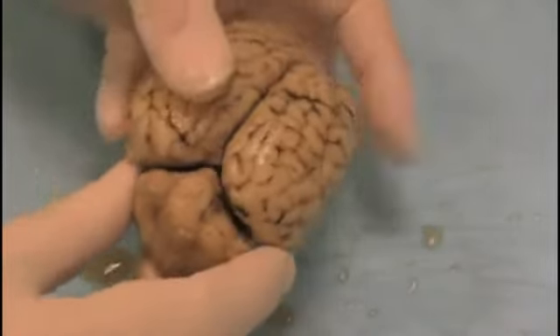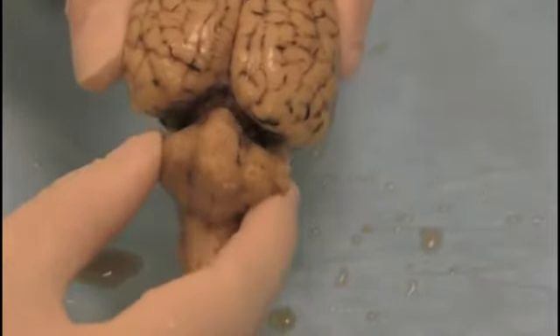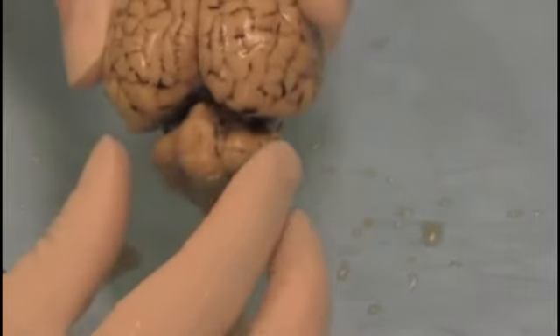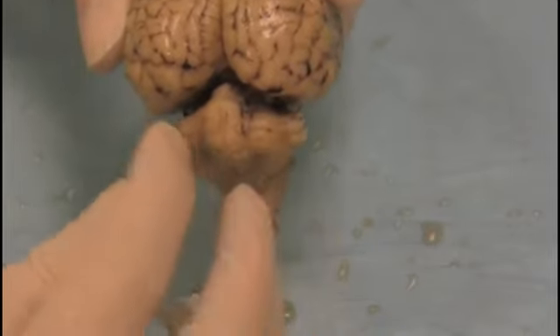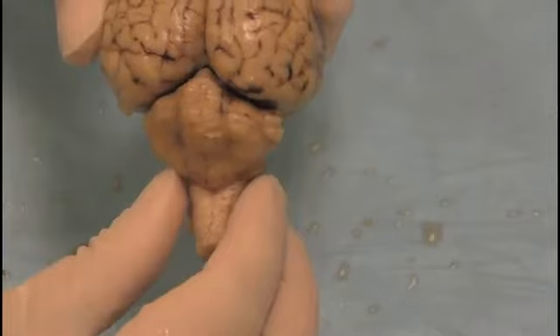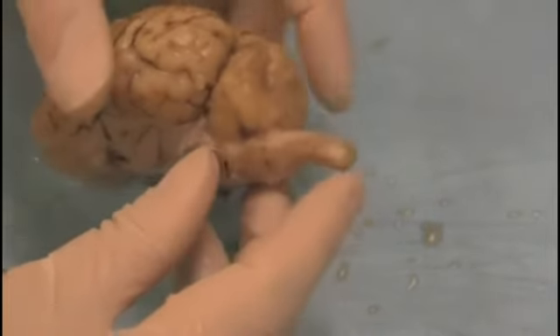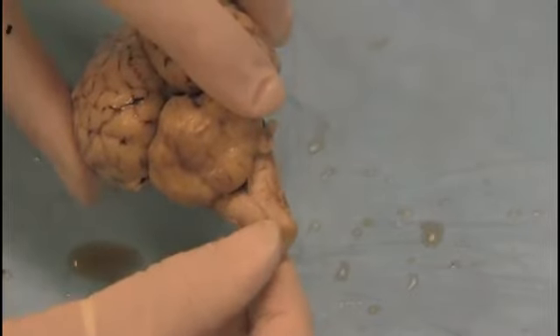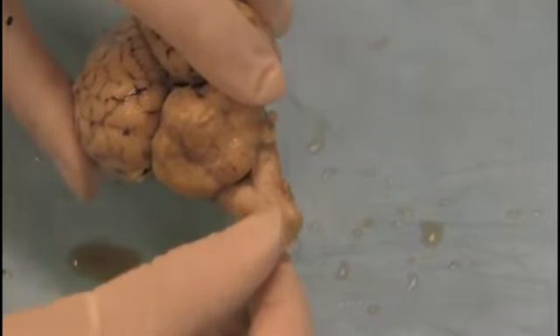Behind the cortex is the cerebellum. The cerebellum is not divided into two hemispheres like the cortex — it has two hemispheres, but it also has a middle area we call the vermis. The cerebellum sits on top of the brain stem, and then coming from the brain stem is the spinal cord.